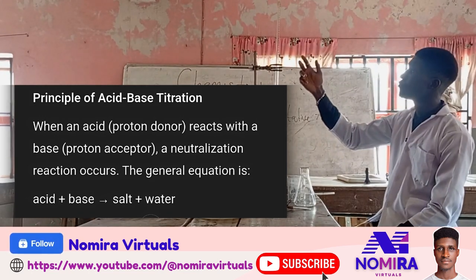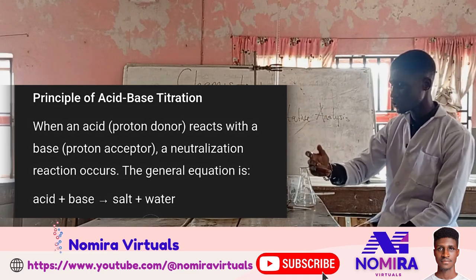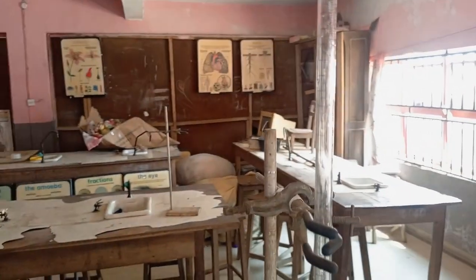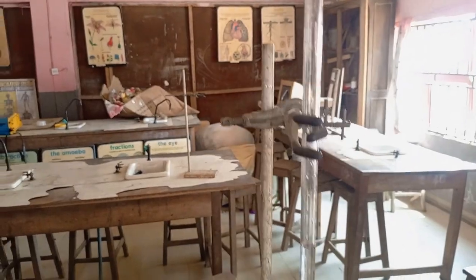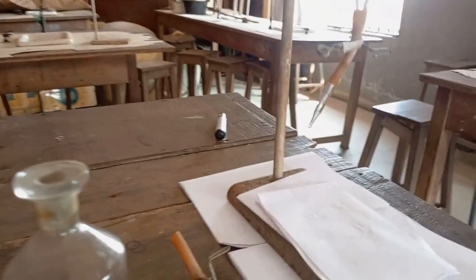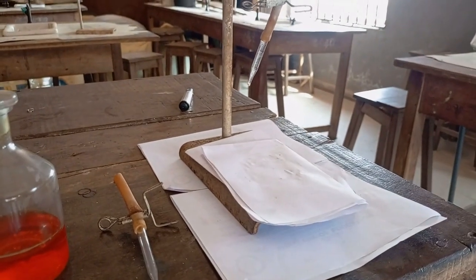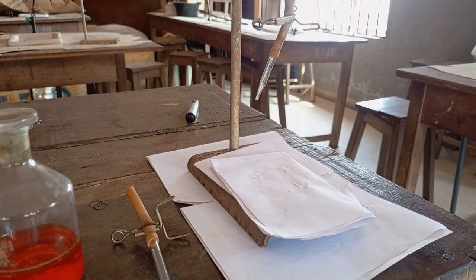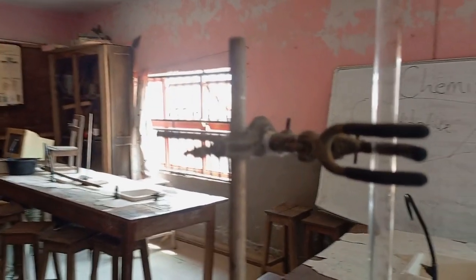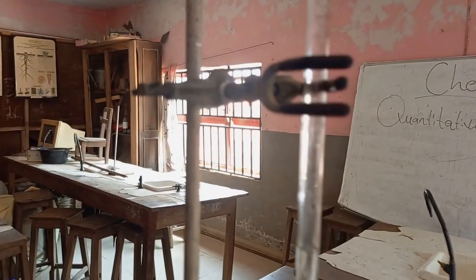So I will go firstly by explaining in detail the function of this apparatus, this setup. This burette is hanging on a retort stand. The retort stand has a base where I kept a white paper replacing a white tile. I am trying to improvise here. Then the retort stand is made up of a clip. You can look at the clip holding the burette.